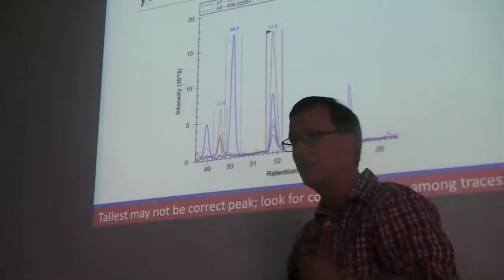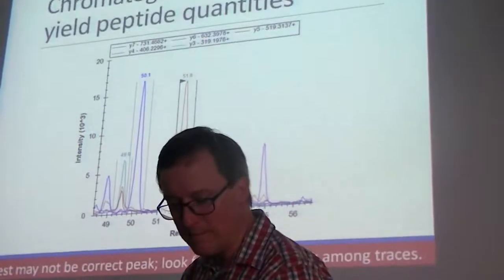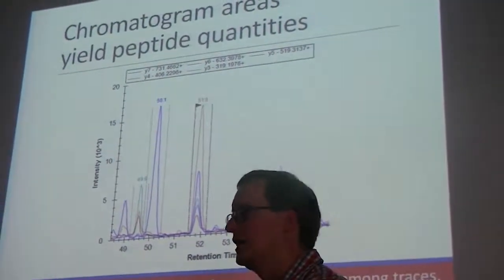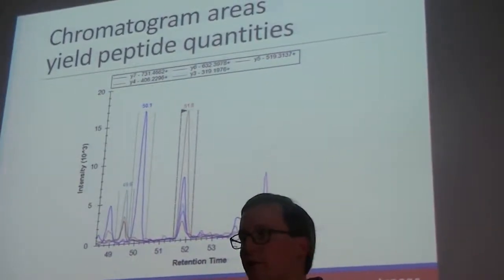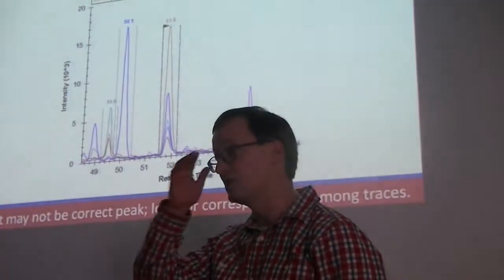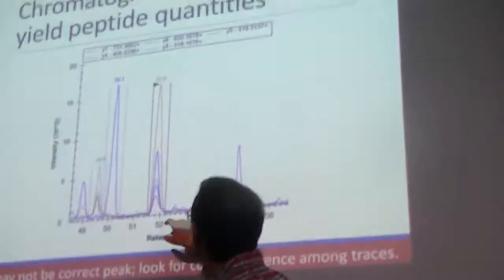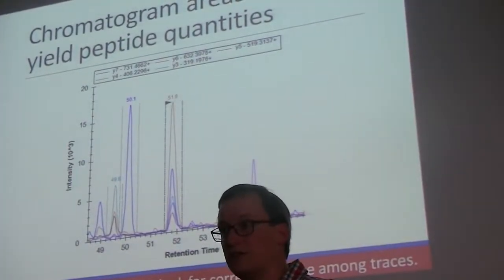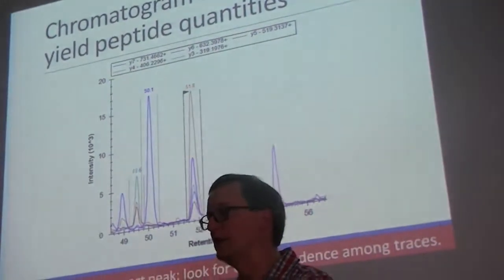Okay. Now we are looking at real-world data. I've talked enough about chromatograms without actually showing you one. Well, here's one. Here we are looking at a range of retention time. This is standard liquid chromatography. We are looking at a fairly narrow region, about 49 to 56 minutes into this experiment. So we're zooming in on one small part of the experiment. We are measuring 1, 2, 3, 4, 5 different fragments or transitions for one peptide. You can see that up in the legend. We've got these 5 different lines that we're going to follow.